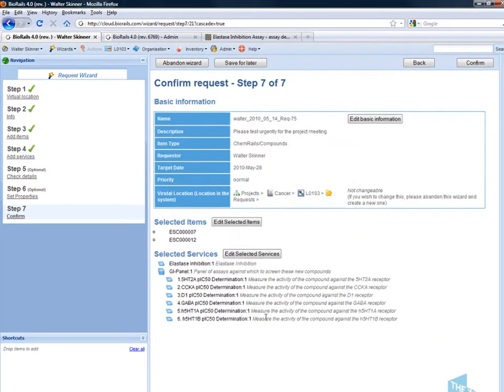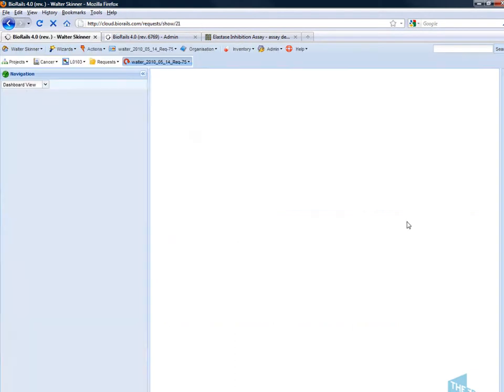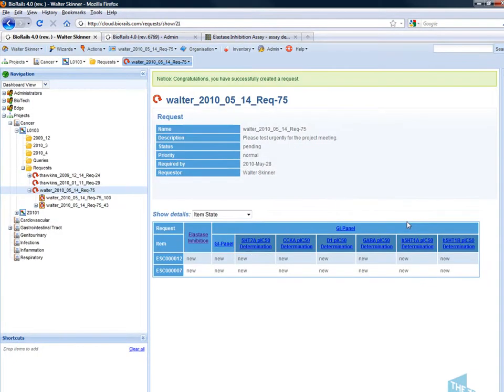The final step is to check the compound selected and the services requested and confirm the request. This provides me with a request dashboard.